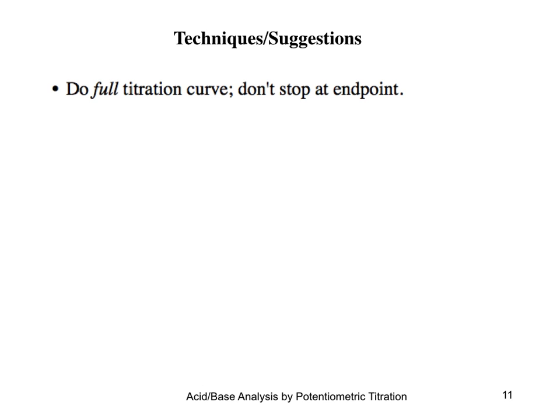Make sure to do the full titration curve. After you reach the endpoint, make sure to continue adding and recording an additional 5 to 6 milliliters of NaOH. Do not forget to add phenolphthalein indicator. If you do not add indicator, your solution will never turn pink.